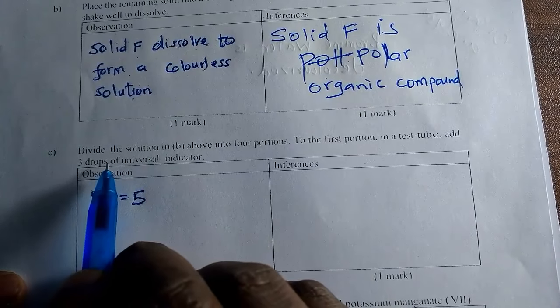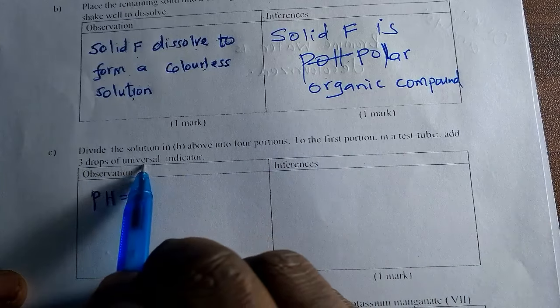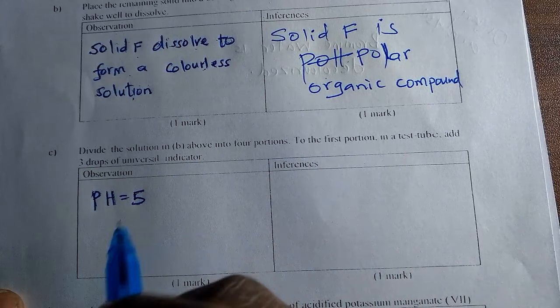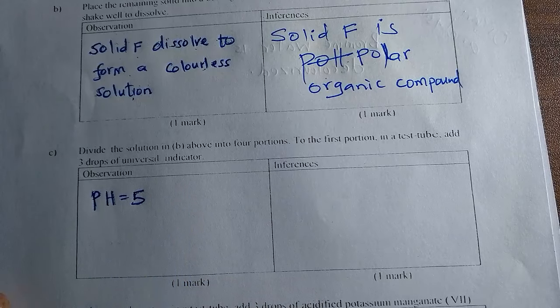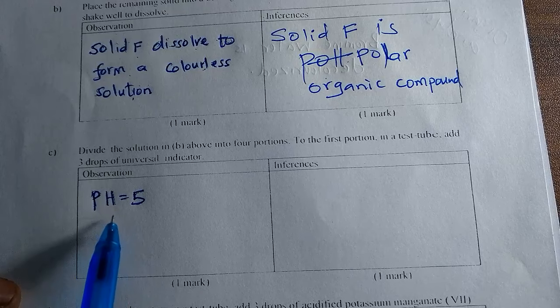Divide the solution into portions. In the first portion, add 3 drops of universal indicator, and check the colors against the pH scale that you are given. When you compare, you realize that the color in your test tube matches the color on the pH scale of 5.